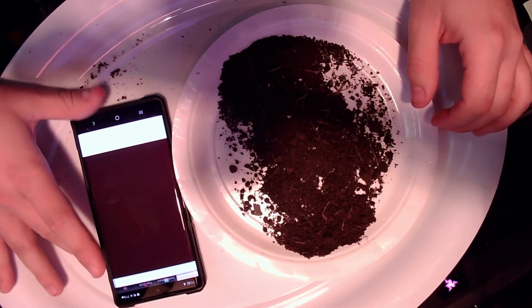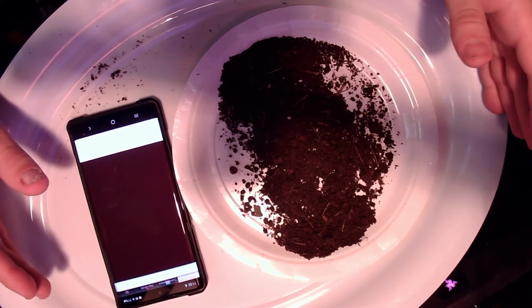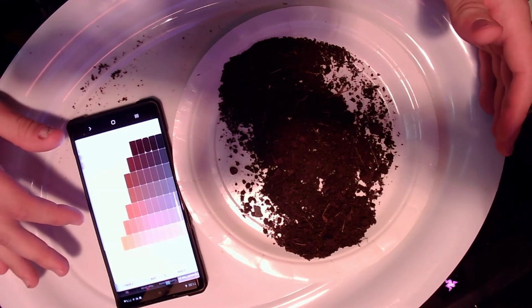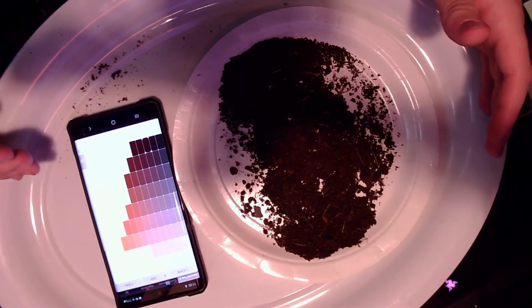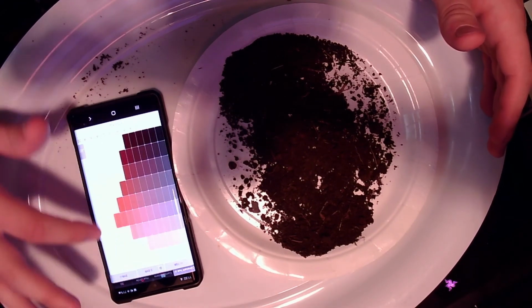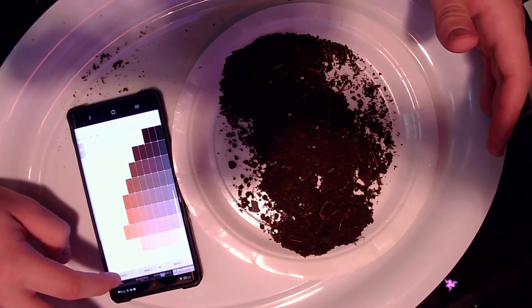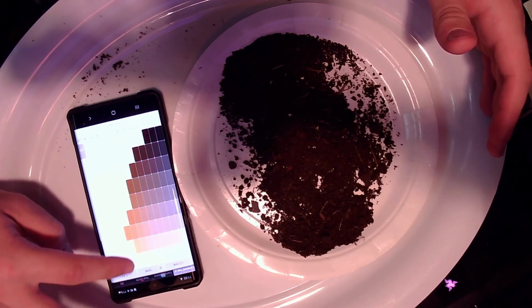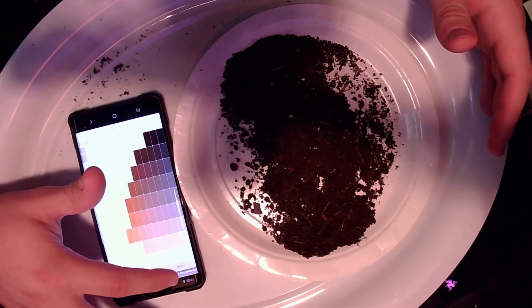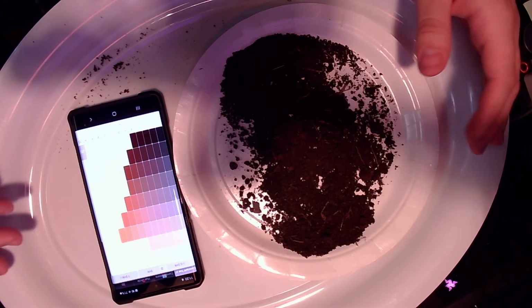So what is probably a good place to start is 5YR. That is pretty much going to be lots of your typical color soils. You might have to go into the 2.5YR maybe, and then probably maybe into the 10YR, maybe down at the bottom for some soils. So 5YR, pretty decent start.